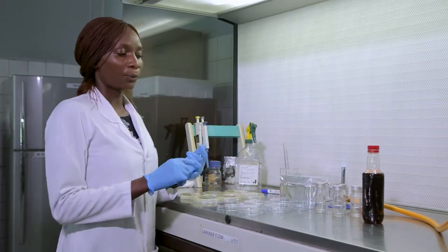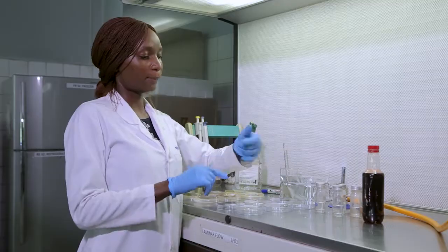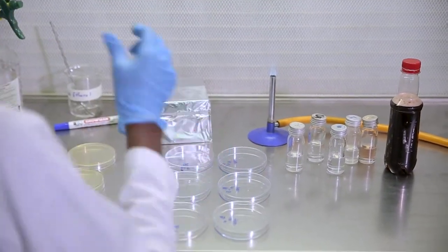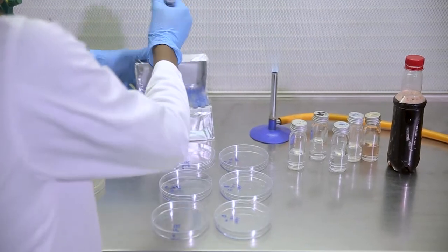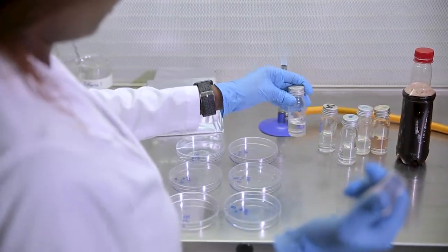And now we are going to put 1 ml of the inoculum. Inoculum is now the liquid inside the sample plus the diluent. 1 ml onto each of the petri dishes. Remember to use sterile tips.